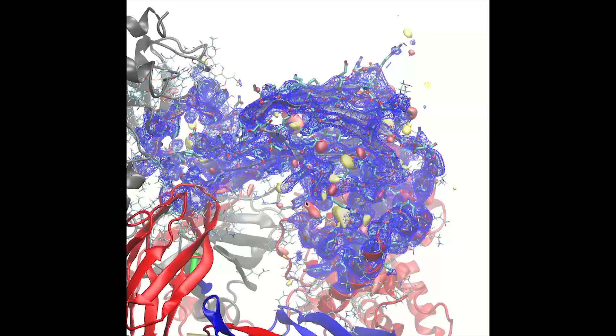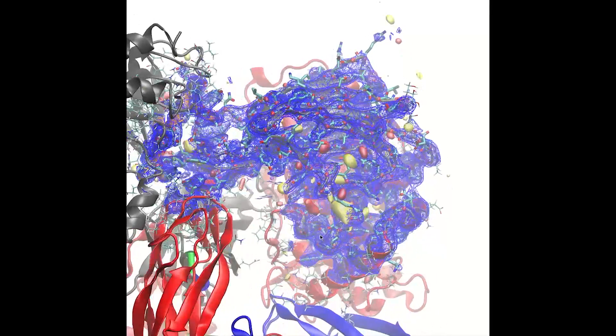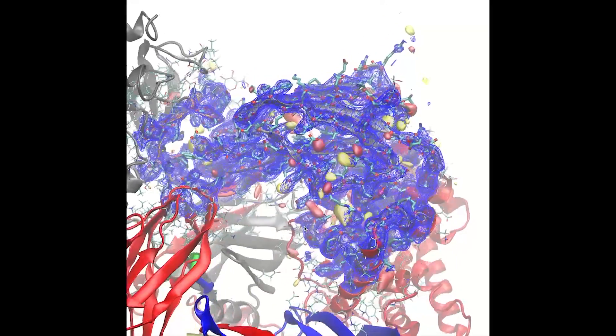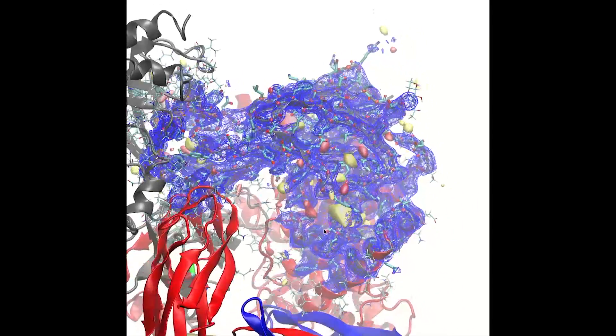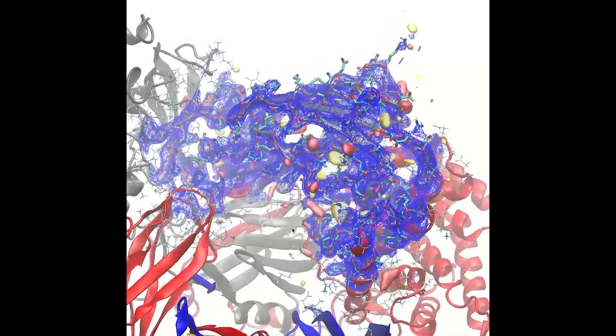In this video I will be using the 3.6 angstrom structure of Complement C4 Accession ID 4FXK to demonstrate the use of IMDFF to interactively explore and correct register errors in low resolution structures.